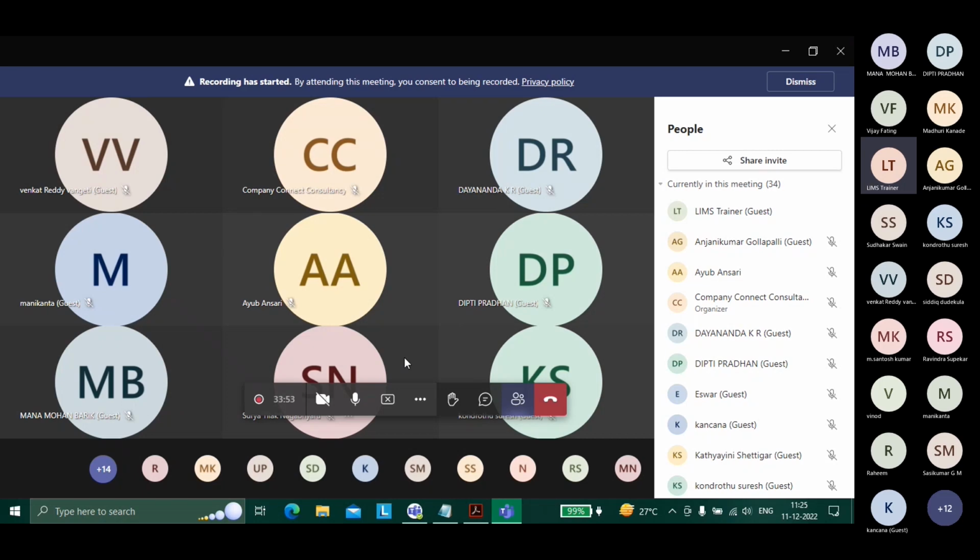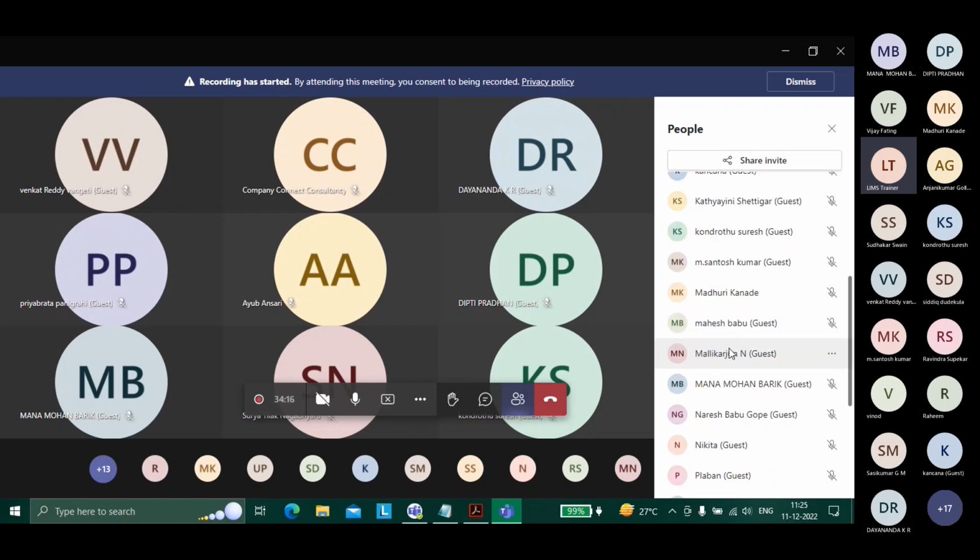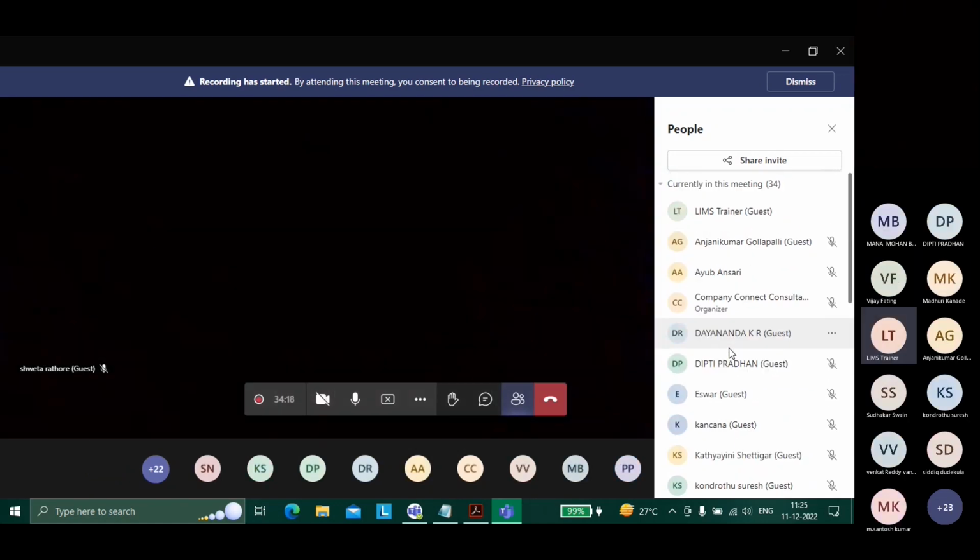For example, while you enter values for a sample, one small example: that sample has a lot of fields. You may have sample number, sample name, there are a lot of fields. I just said two fields. But for example, your client comes and says that no, I need one extra field. Then what we can do is configure it through table master. There is one option where we can configure and add one more field in the table.